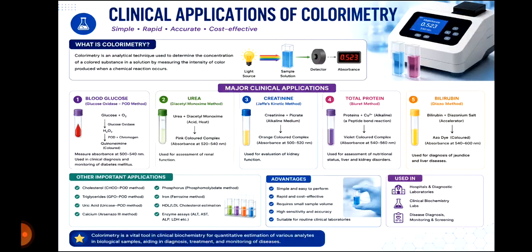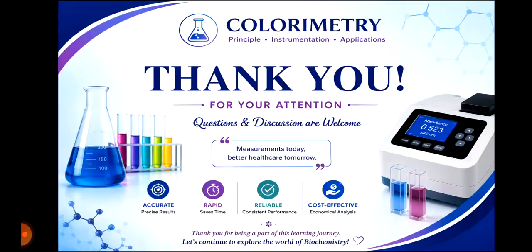It is simple and easy to perform. It is rapid, cost effective, requires small volume, highly sensitive, and accurate. And it is suitable for clinical laboratory analysis. It is used in hospitals, clinical biochemistry labs, and disease diagnostic monitoring and screening.